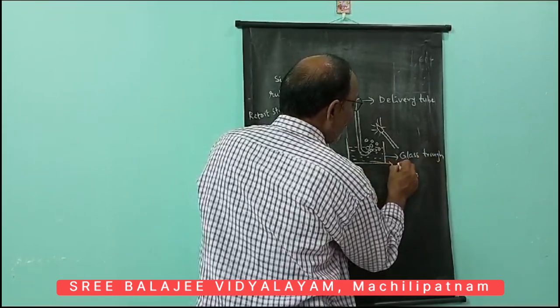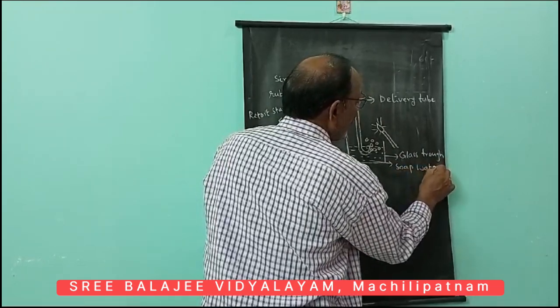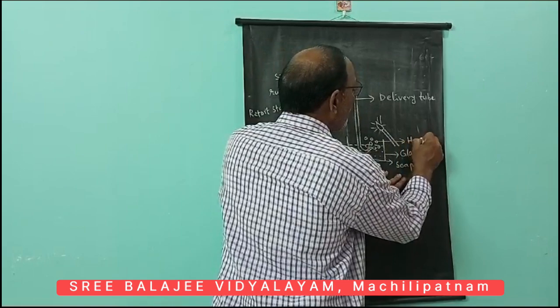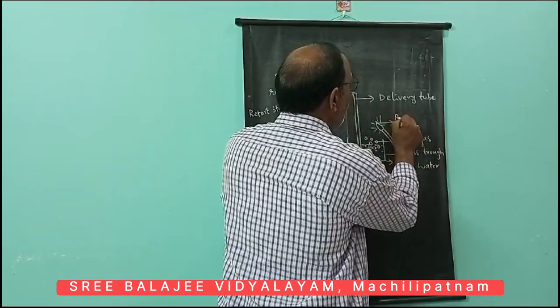Inside that we have soap water, and these are the hydrogen gas bubbles. These bubbles indicate the hydrogen gas, and this is the burning splinter.